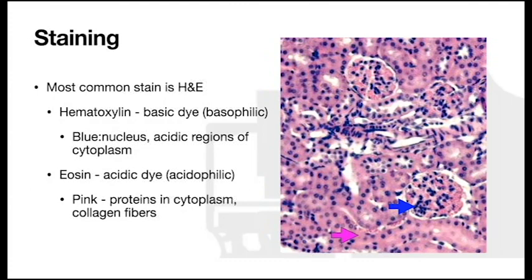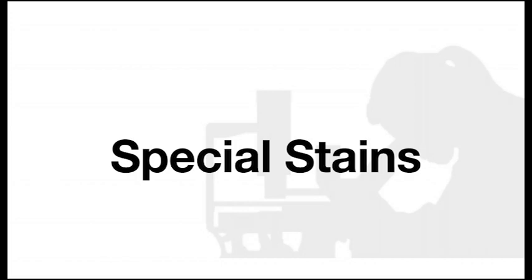Although H&E staining is the mainstay of histological tissue examination, we need special stains to provide better visualization of specific structures based on their chemical, biological, and pathological characteristics. The first special stain is the periodic acid-Schiff stain that reacts with glycogen granules, staining it magenta.